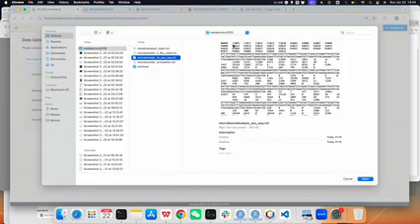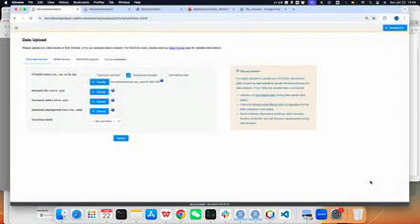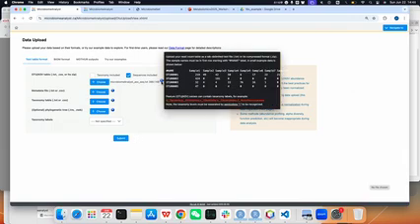Here you can see this is a sample ID, and then there is a sequence, and then we have the abundance. We just need to pay attention that the name of the first column must be a capitalized name. This is for the recognition of our website. So you just submit the first file, and you can hover here to see the example data. Always format your data like this.